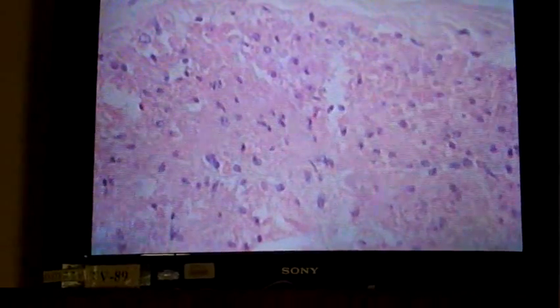Okay? Questions about the stomach? I'm sorry, go ahead. No, go. Would you just say the shape is the way that you would know that that's serous tissue?